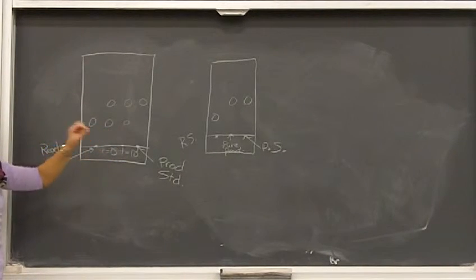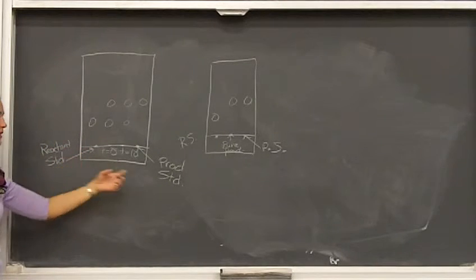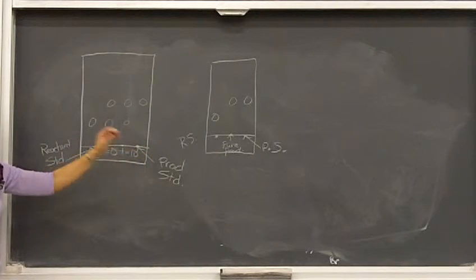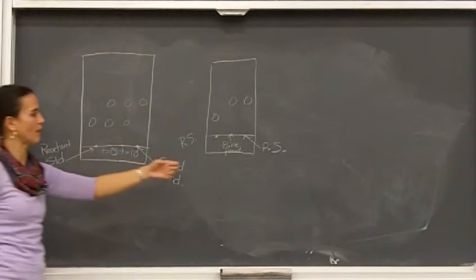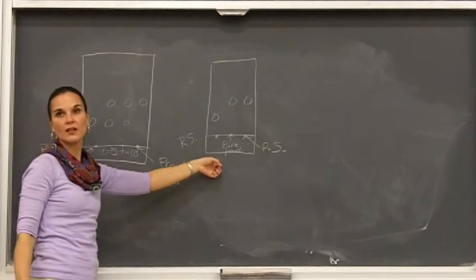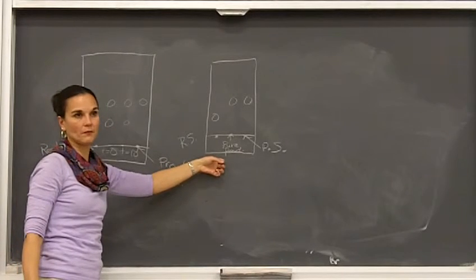For the pure product, you have to spot liquids. So we have dilute liquids of the reactant standards. You have to spot a dilute liquid on the TLC plate, so you can't spot a neat liquid. It has to be something that's dilute, and your product is a solid. So in your lab manual, it tells you how to dissolve it into ethyl acetate to be able to do this TLC plate. All right?